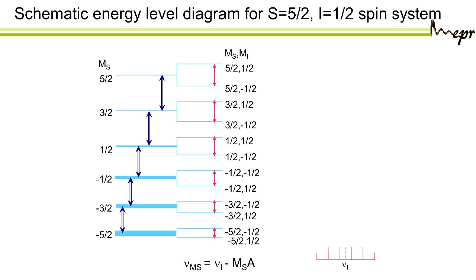Okay, so now for the ENDOR, if we can selectively look only at this transition, then the one below will give us the line corresponding to the two ENDOR frequencies that we see here in the bottom. And now if you plug it into this equation, you see that these are the two highest frequency lines. Yeah?